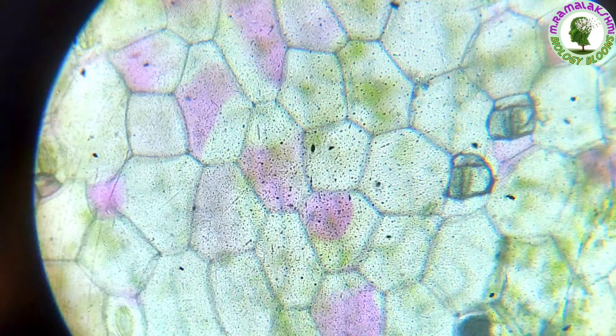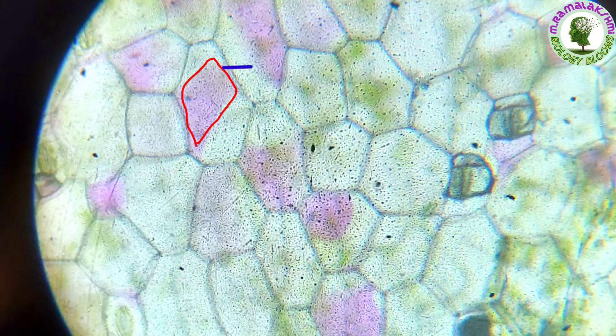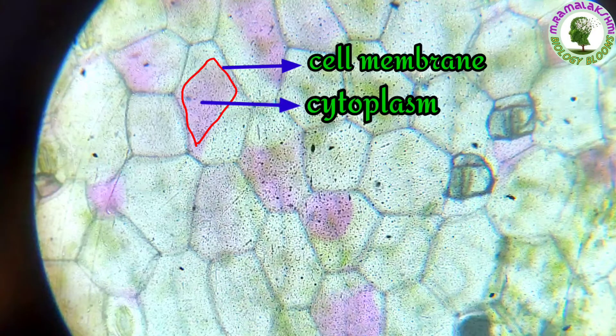Children, observe it. The outer boundary of the colored area is the cell membrane. The colored part is the cytoplasm. The cell membrane separates the cytoplasm from the external environment. And this is the cell wall — the outermost layer of the cell. It is present only in plant cells and absent in animal cells.